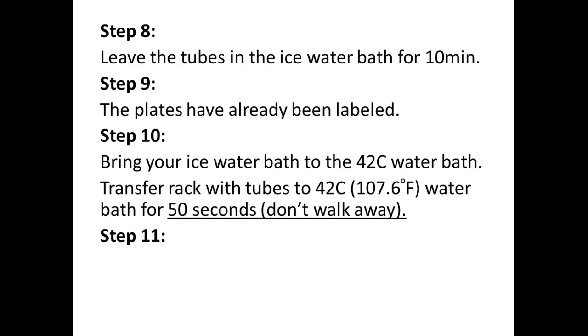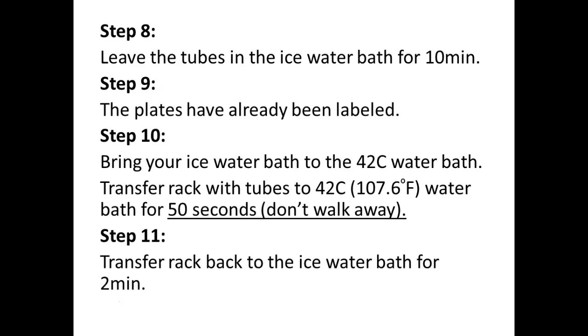And I would try sometimes, when we're doing multiple things, and you would walk away and it wouldn't work if you left it in there too long. So the other thing is, keep your ice bucket right there too, because as soon as those 50 seconds are done, you're going to transfer your rack right back to your ice bucket and then bring your ice bucket back to your lab bench. You're going to leave it on ice for 2 minutes.